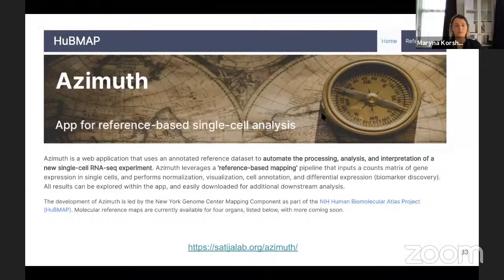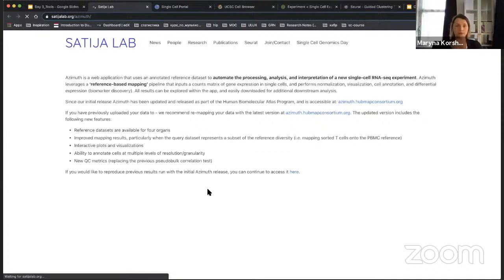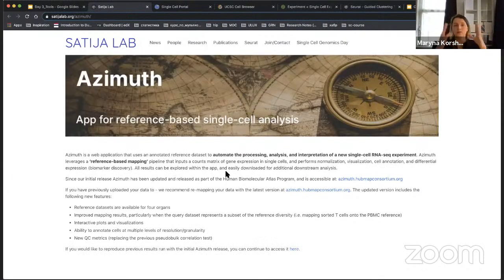I think for people who are already familiar with single cell, it will not be some new discovery, but one of these freshly released tools, which also allows you to analyze well-described data sets, is called Azimuth. It's a project, or part of Seurat, where you can analyze your data set even from a single cell multi-omics perspective. On this tool, you can match and observe data previously processed by the group members from the TG Lab, and match your data set information to the information presented in Azimuth.